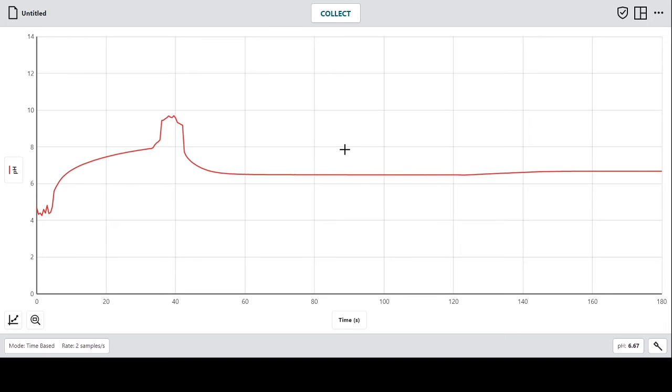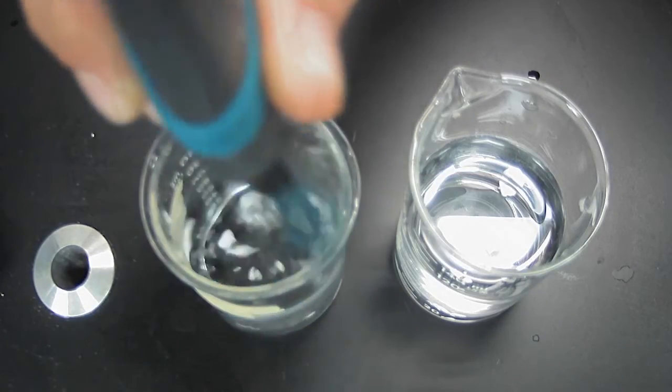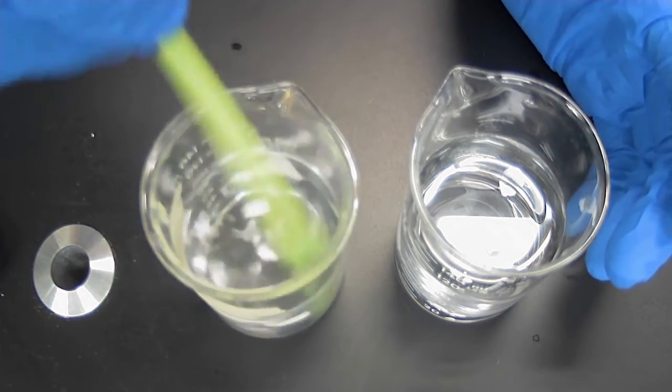And actually, if we can switch back, I'm going to pull up. Nope, there's still a little bit, but these shells in this one are almost gone, just because we have added so much CO2. Think like Mr. Herzog was doing, agitating it a bit, just like it would be in the ocean, right?